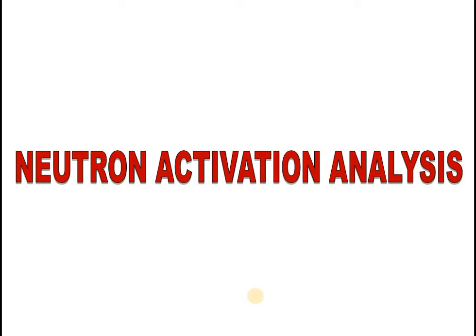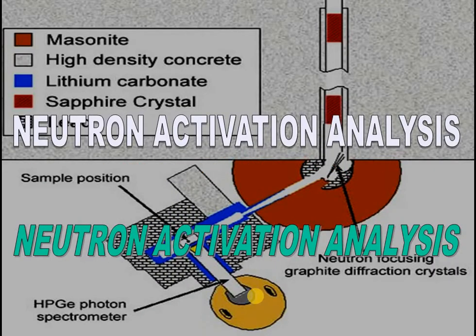So here, instead of protons, neutrons are used as projectiles. Okay, neutrons are used. Making use of neutrons, high energy neutrons, or we can say of some certain specific energy. So in neutron activation analysis, we prefer a certain type of neutrons. Neutrons of varying energies are available, but here we will prefer some specific range of energy. What energy, we will see very soon.